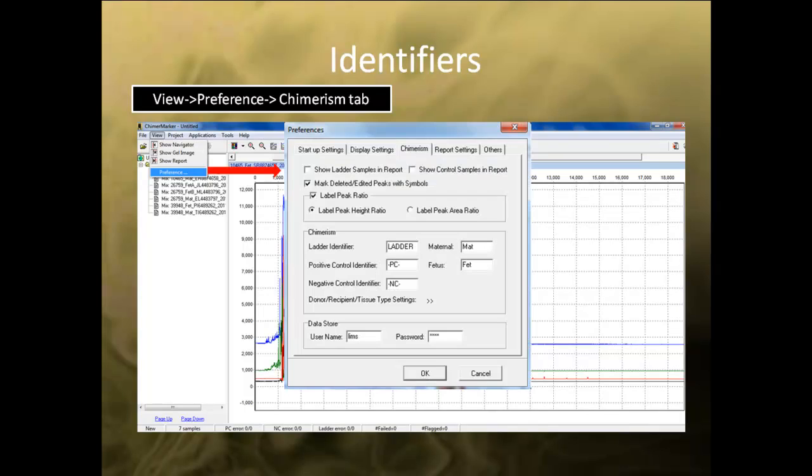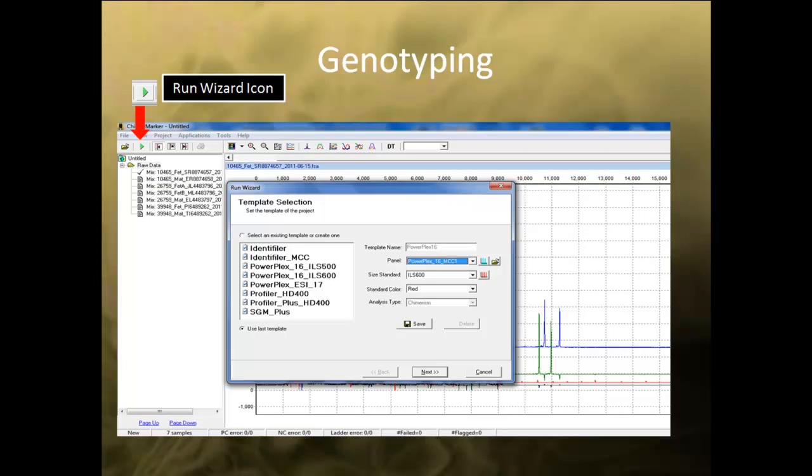To set the identifiers, go to View, Preference, Chimerism tab to bring up the dialog box. In the Maternal and Fetus field, input the identifiers that you want to use for identification of the maternal and fetus samples. The identifiers entered here must be present in the sample name. Once the identifier has been set, you can select the Run Wizard icon in the toolbar to begin genotyping.